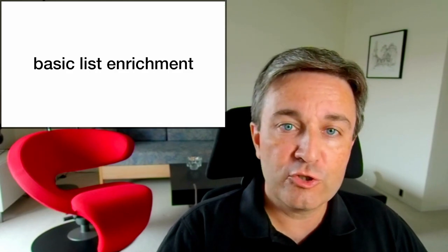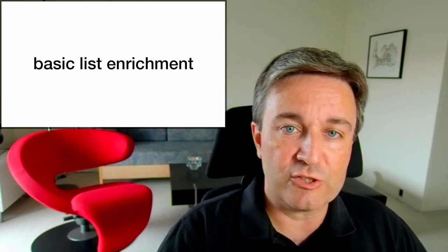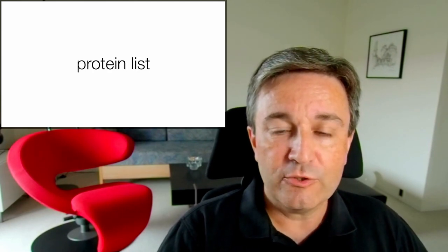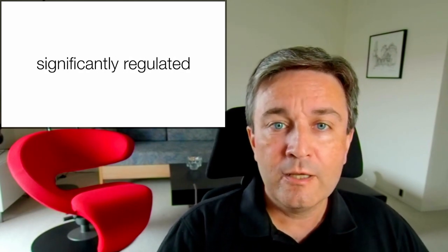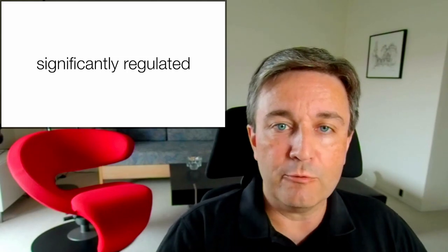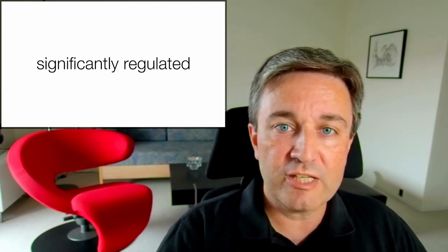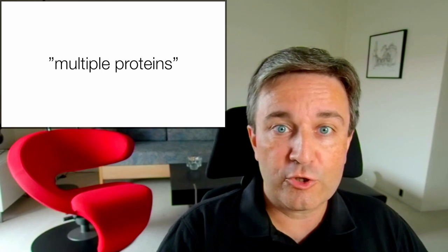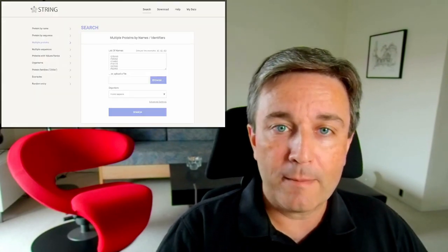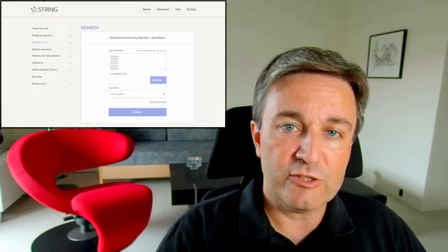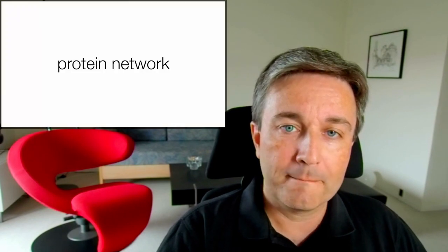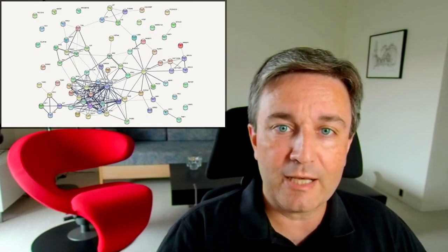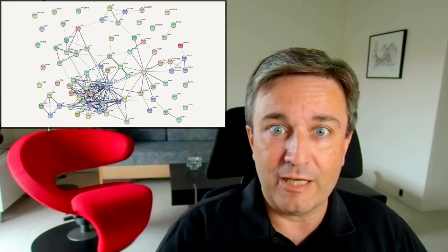With these genesets, you can do two types of enrichment analysis. The first is basic list enrichment. In this case, you provide a protein list, which would typically be the significantly regulated proteins from some study. You go to the multiple proteins search option in STRING, and in the web interface, you simply paste in your list of proteins and hit search.